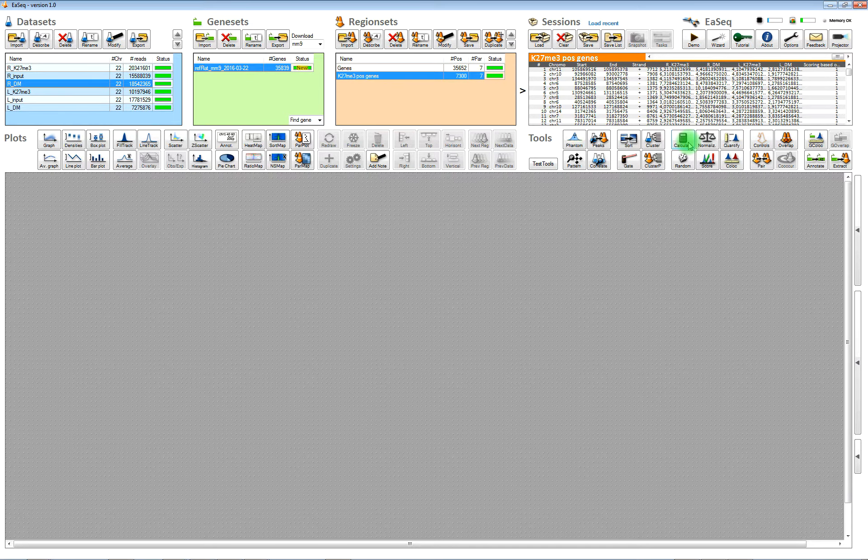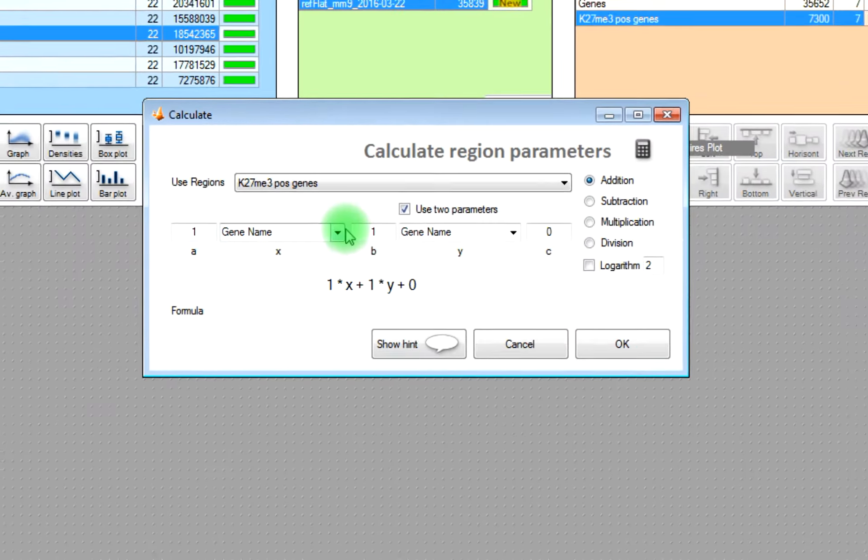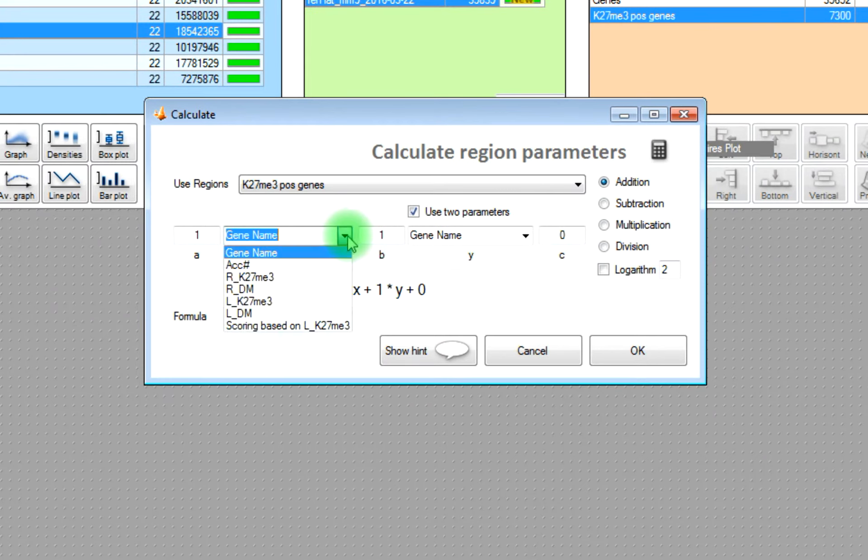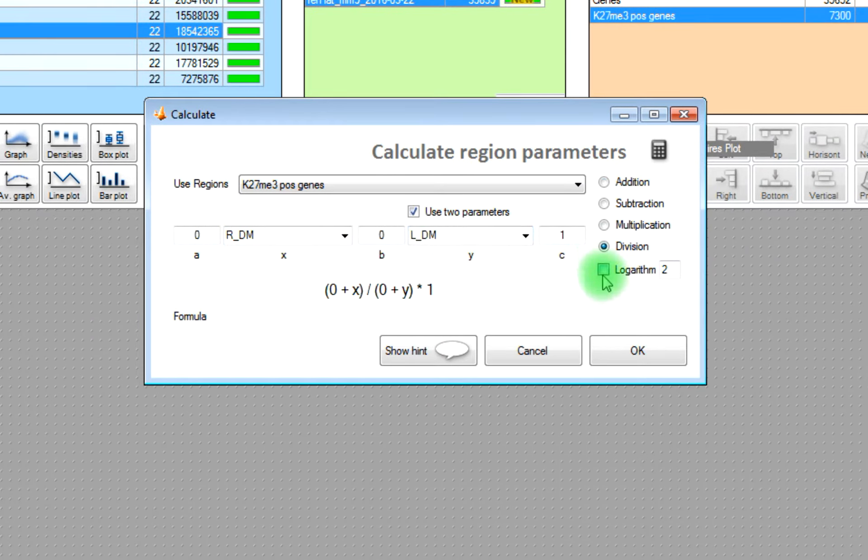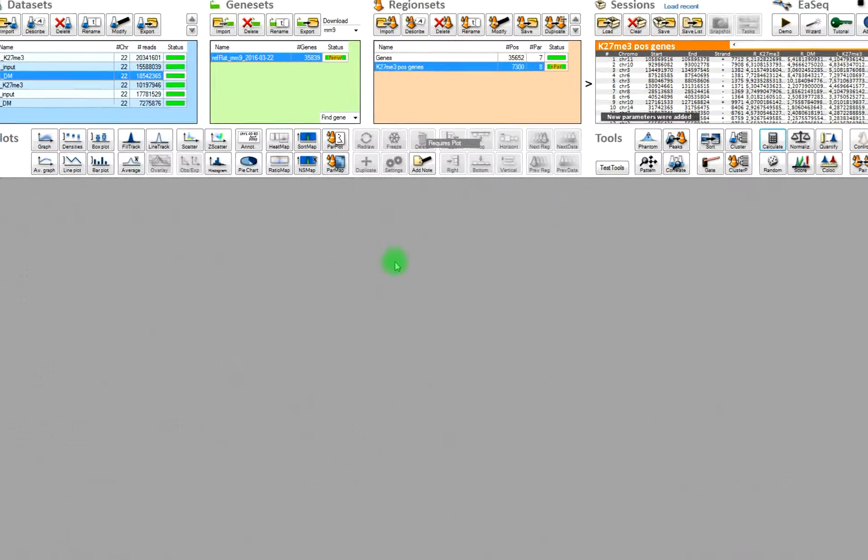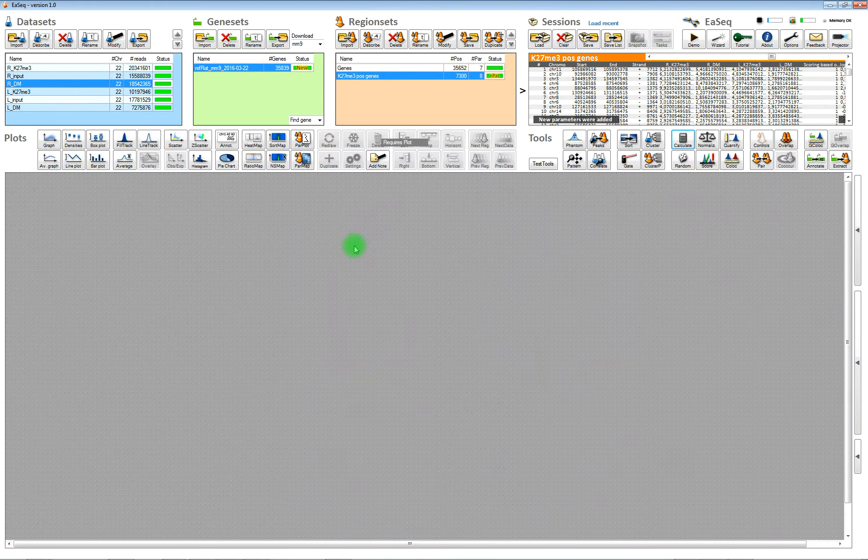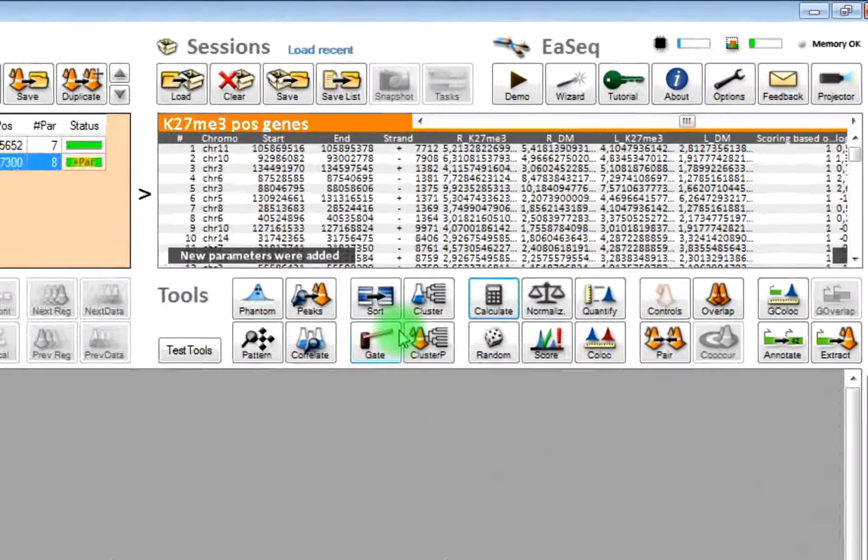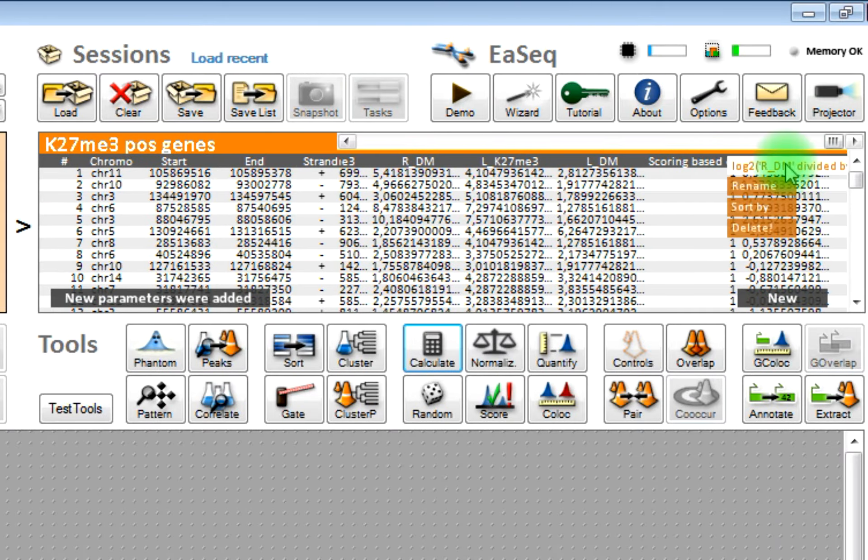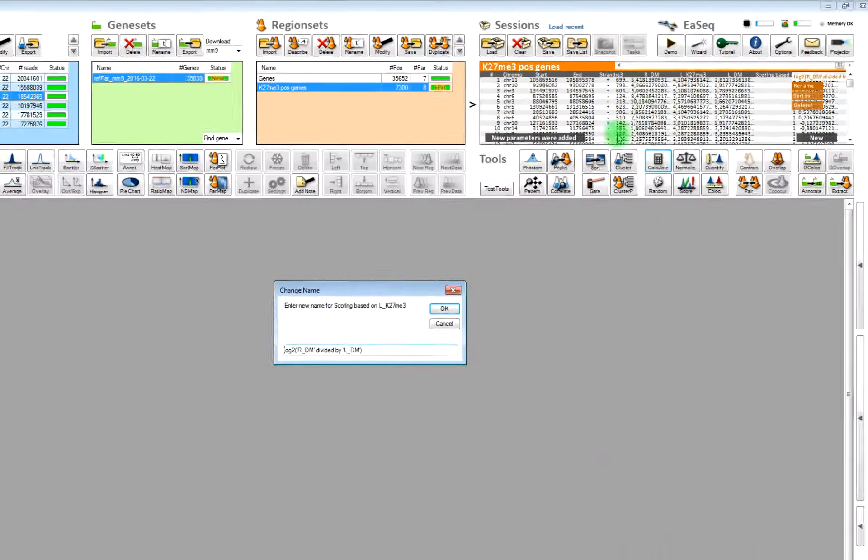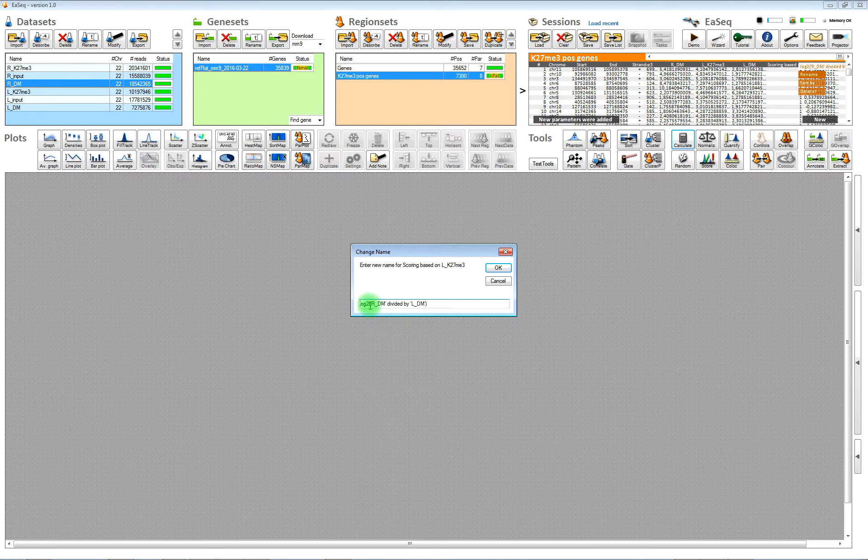Then we can also calculate the log twofold difference between some of the quantified values. Here we will quantify the log twofold difference between right side double mark and left side double mark. Choose divide and then log two, and then we get a new column, a new parameter where you have the log twofold difference between the two quantified values. You can also rename those.